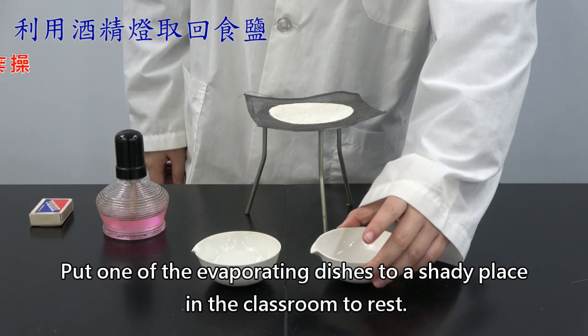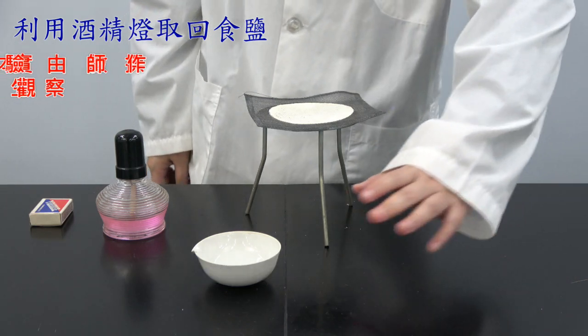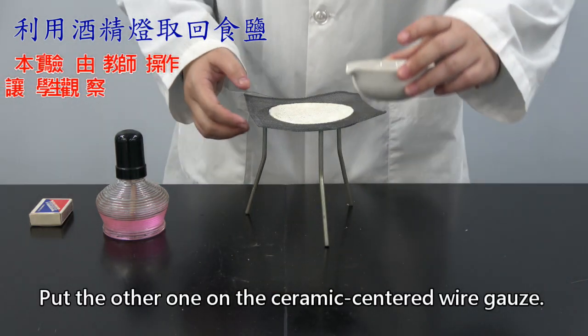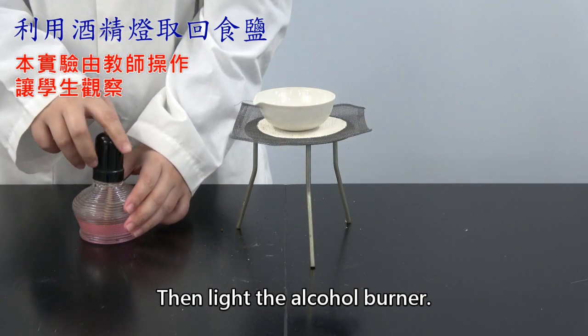Put one of the evaporating dishes in a shady place in the classroom to rest. Put the other one on the ceramic-centered wire gauze, then light the alcohol burner.